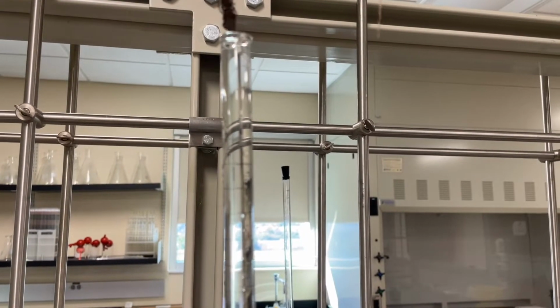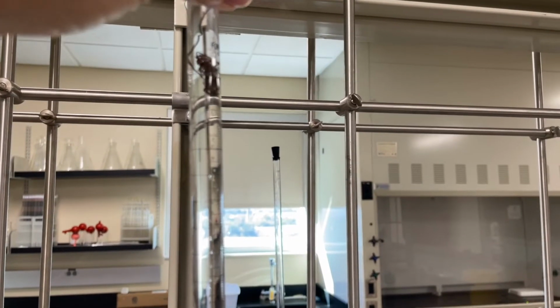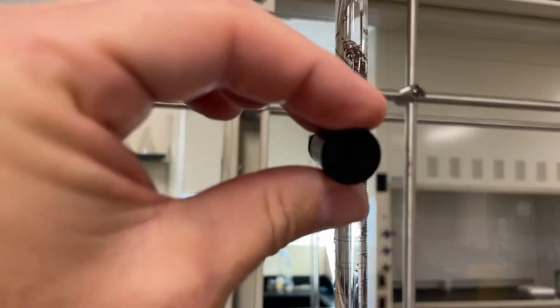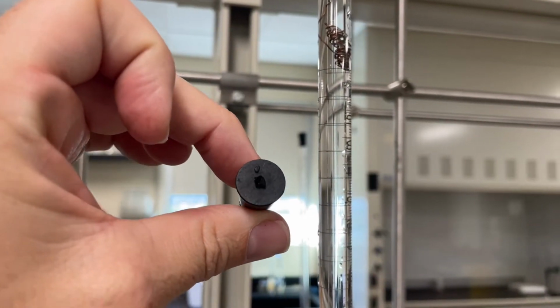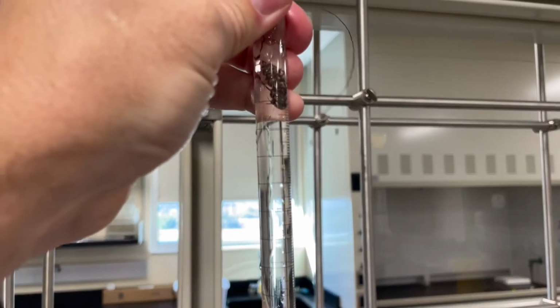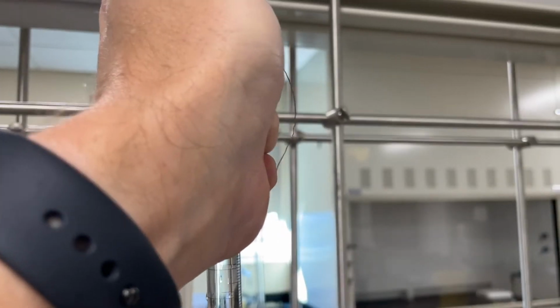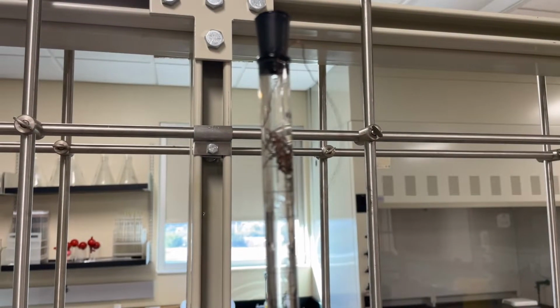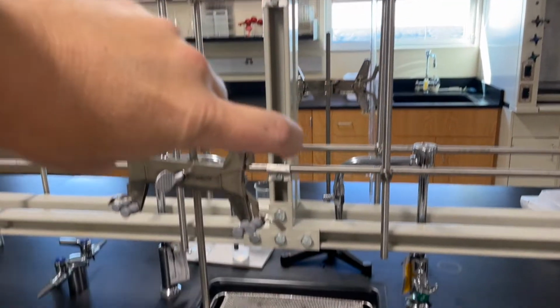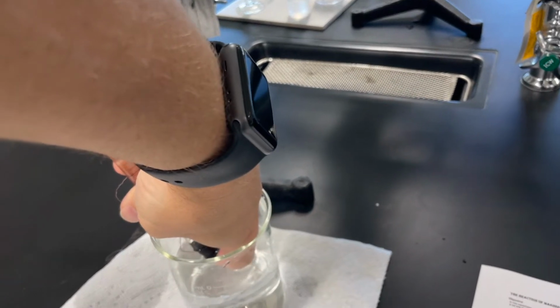Next, we submerge our magnesium into our burette. Note that mostly at the top of this at this point is just water because our HCl is at the bottom and it is more dense than water. So we'll stick our cap on our stopper. Our stopper's got a hole in it so that we can have the gas formation and our solution will be pushed out so that we can measure our gas effectively. So we'll go ahead and invert it and we'll stick it into a water solution inside of our beaker.